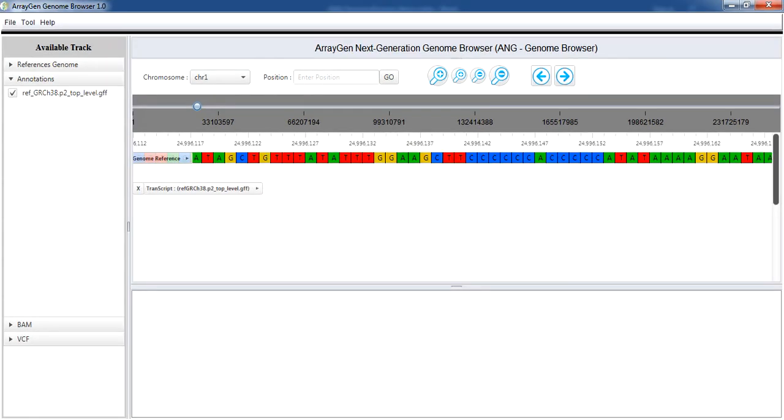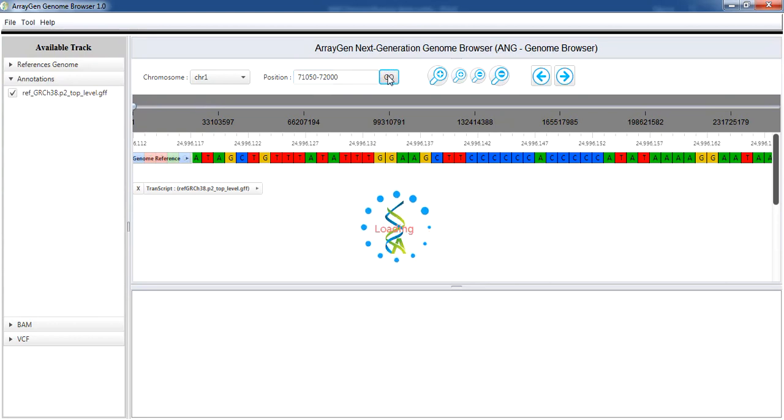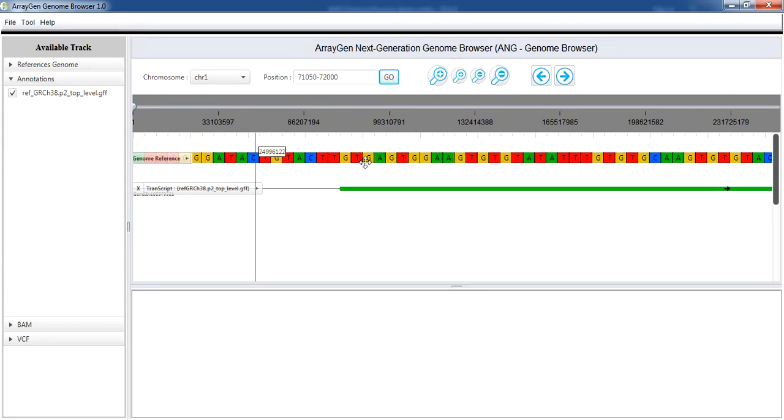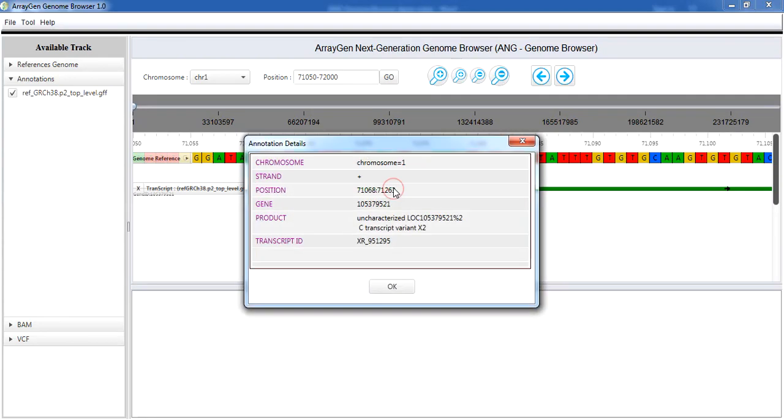You can jump to a specific location by providing the nucleotide position in the position box. Clicking on a particular gene, green portion, displays the annotation details.